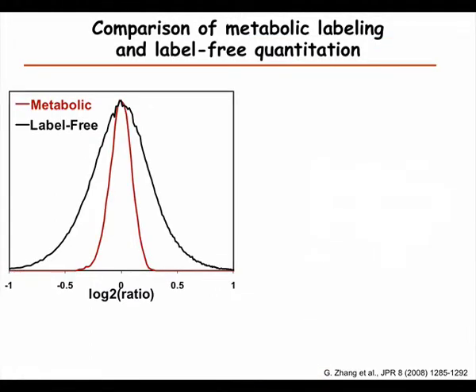So this is just one example where, on the same experiment, we looked at both label-free and metabolic labeling. This is the same sample measured twice, either by metabolic labeling or by label-free quantitation.